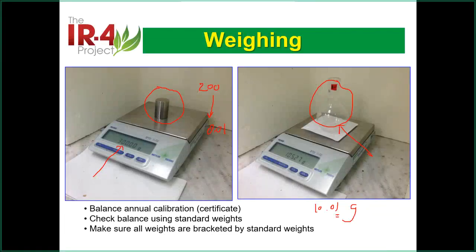You probably also want a number in between, around 10 grams, because that's the most important number you want to verify. So you use all those standards in this range to do the work.